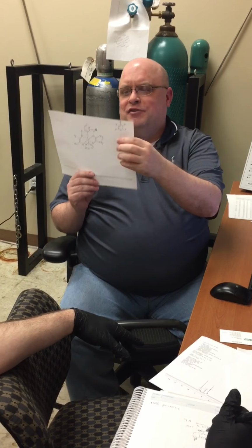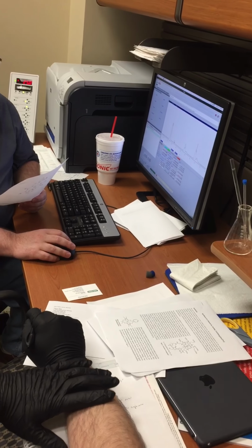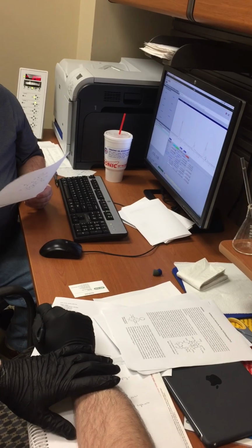So let's zoom in here. So here's our doublet. This one here is, of course, the one next to the nitrogen. But you notice we have a triplet here and a triplet here. Your stuff's falling apart a little bit. You can't help it. In organic, you get the nice, pretty spectra. They're all nice and clean. There's no impurities. Well, that's not the real world.